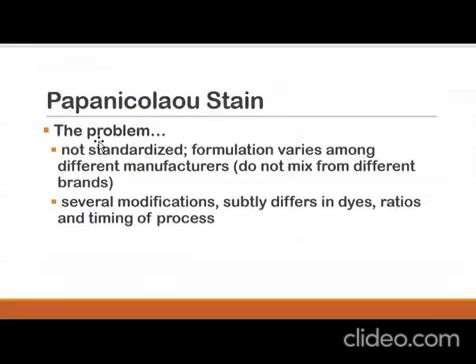So, of course, no matter how good something is, diba? No matter how perfect it might look, there would always be imperfections. Correct? Wala pong perfect sa mundong ito. Okay? So, what could be now the disadvantage? What could be the problem when using Pap stain? So first, it is not standardized. Okay? So the question is, why is it not standardized?